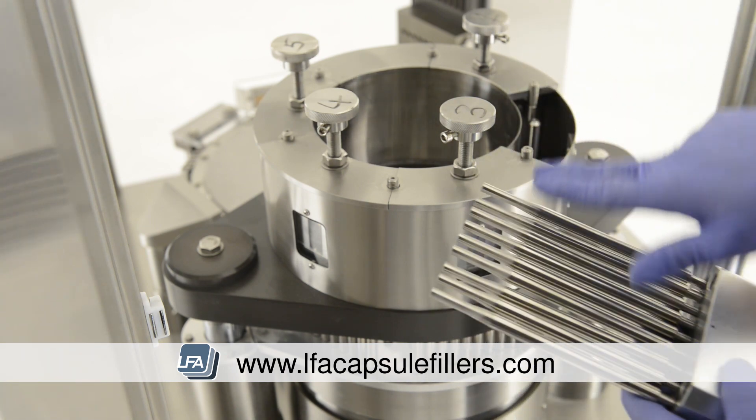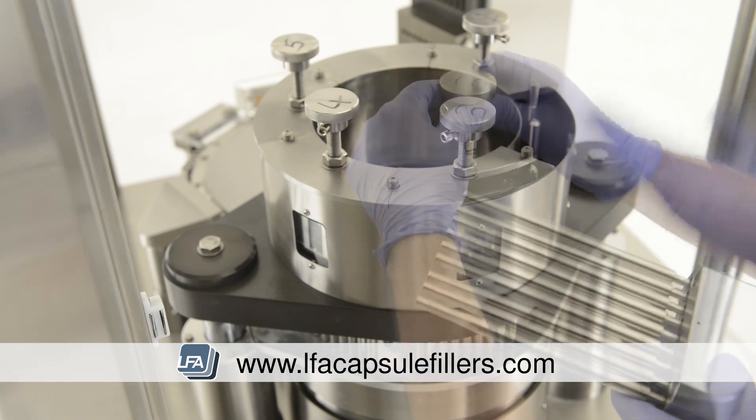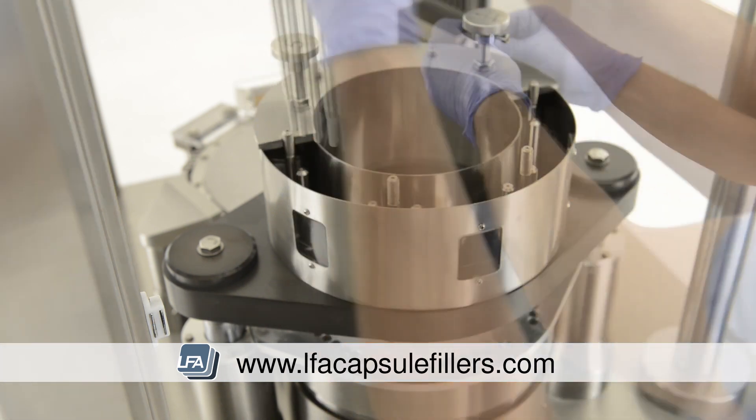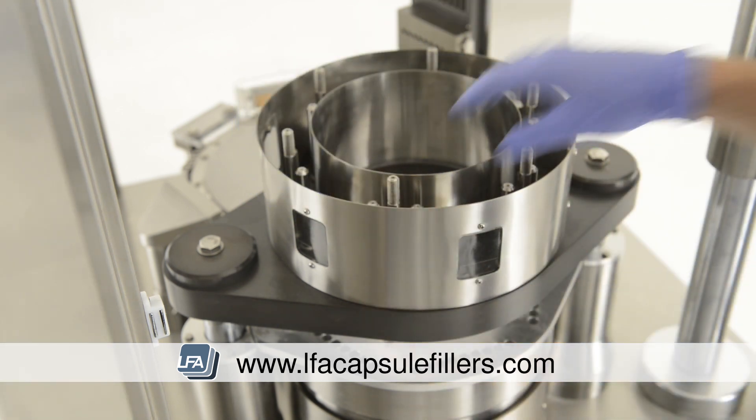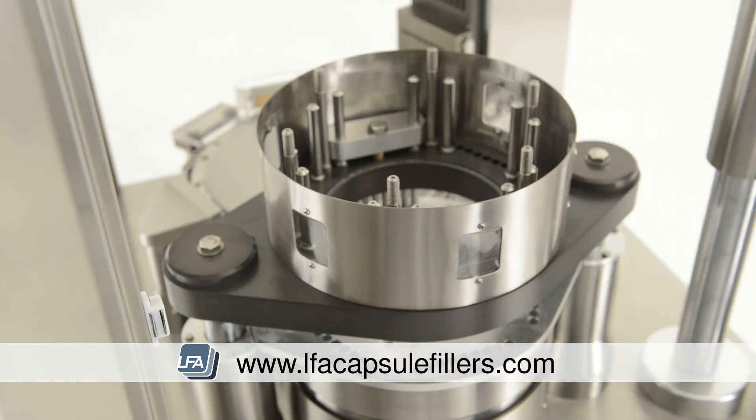Be very careful with the tips of the tamping tooling as they're fragile. Lay them down gently so as not to damage them. Remove the middle casing and the outer casing and place them to one side.